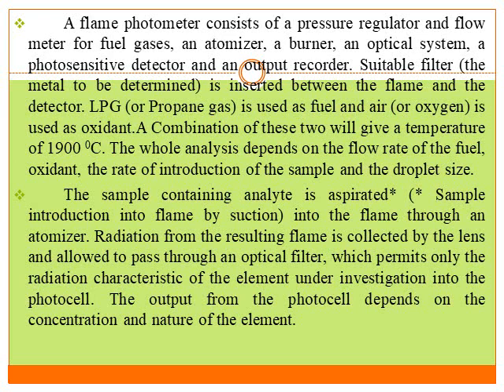This radiation is the absorbed radiation. A certain intensity of radiation will get emitted by the atoms which get excited from the ground state to the excited state, and certain radiations are absorbed by the metal atoms which are not excited and remain in the ground state.